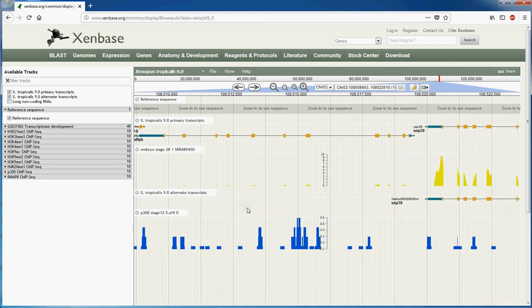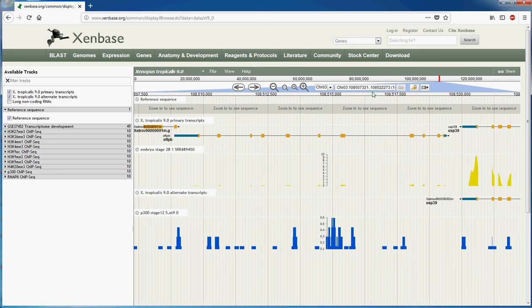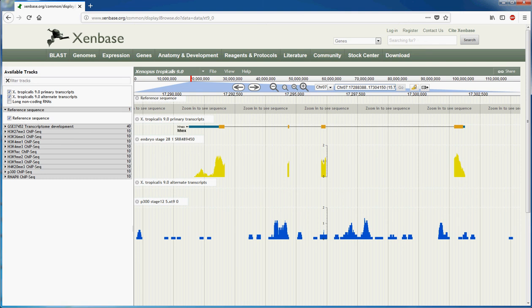Now, if you want to search for a particular gene that you're looking for, not so much coordinates, but a particular gene model you want to see and you know the name of the gene, go back to the locations field here, remove the text, and let's say I'll go to the H-hex gene. So you start typing, it'll limit the results as you type, and click on the result that you want to go to. It'll take you directly to that location of the gene model H-hex and refresh all the tracks at that location as well.